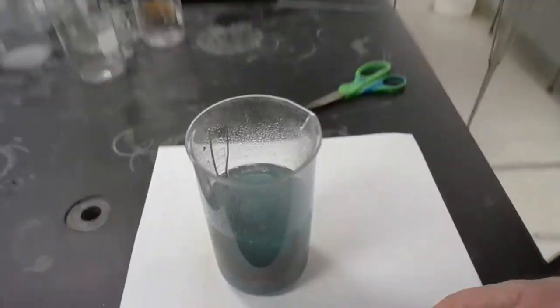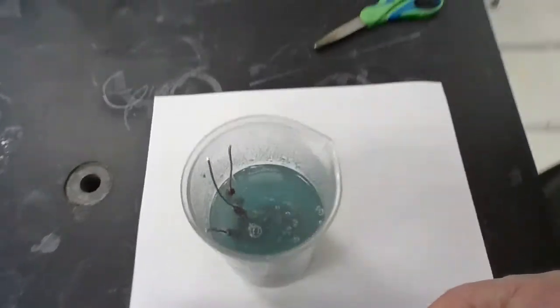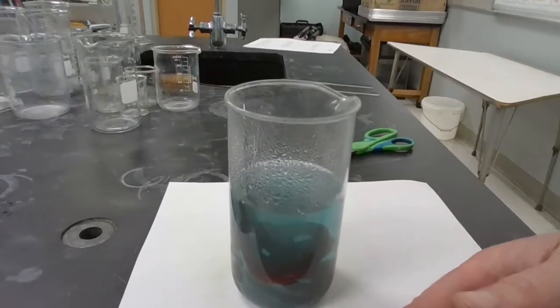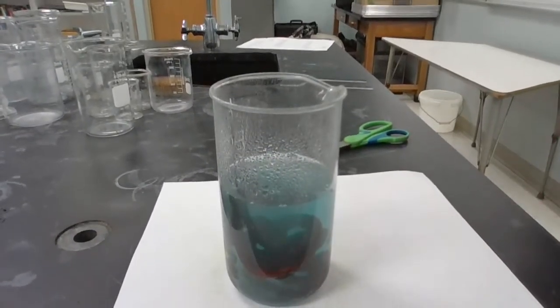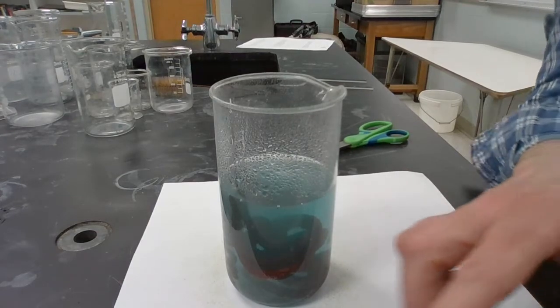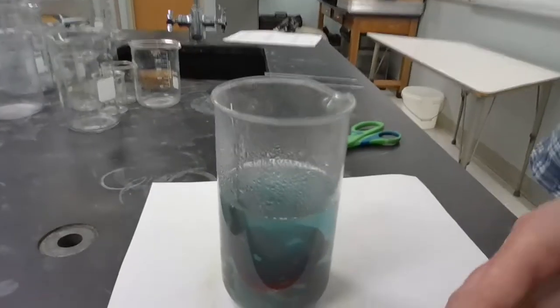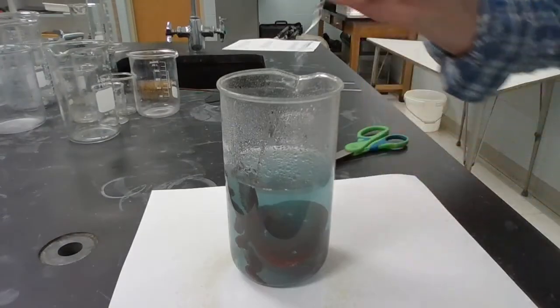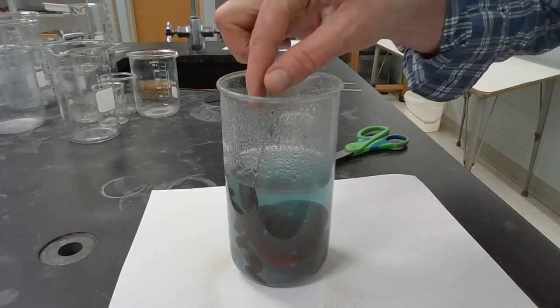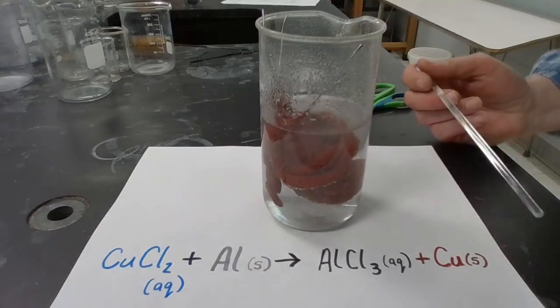Still going. Still taking a lot of time. And there we have it.